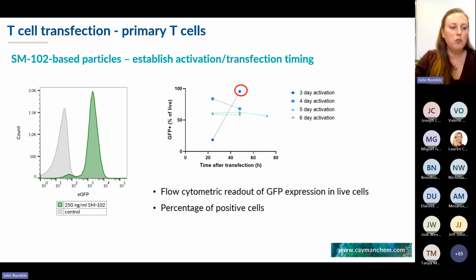The kinetics of expression were different when transfection was initiated after longer activation times, which highlights the necessity of testing this time course comprehensively. For further studies, we chose to continue with the 3-day activation and 48-hour transfection workflow.